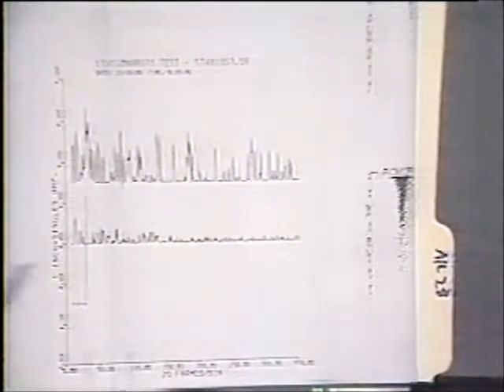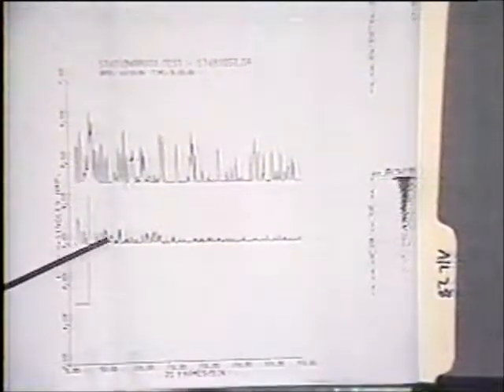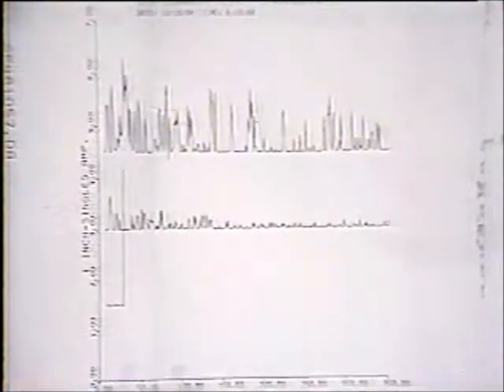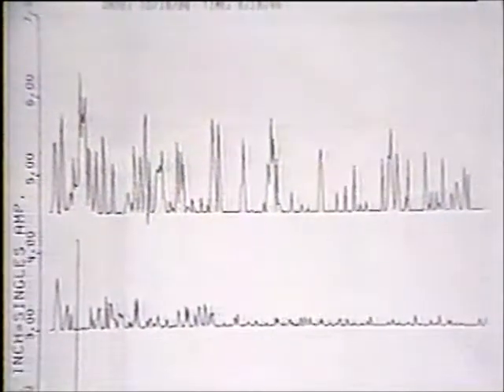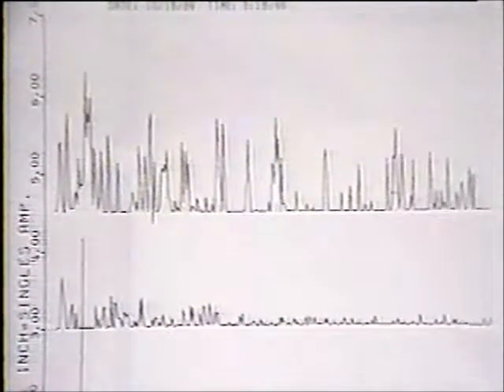Beware. Here's another example of a lack of stationarity. In this case, this was an acetylcholine activated nicotinic channel. At the beginning of the record, there's a lot of activity, and as time goes on, the activity drops off and drops off and drops off. Again, if you take the kinetic and duration on and off data, you lump it together into a histogram and try to fit it, you're going to get a very confusing answer, because the kinetics here are not the same as the kinetics here. It's not simply due to a loss of the number of channels. There are real kinetic changes taking place.